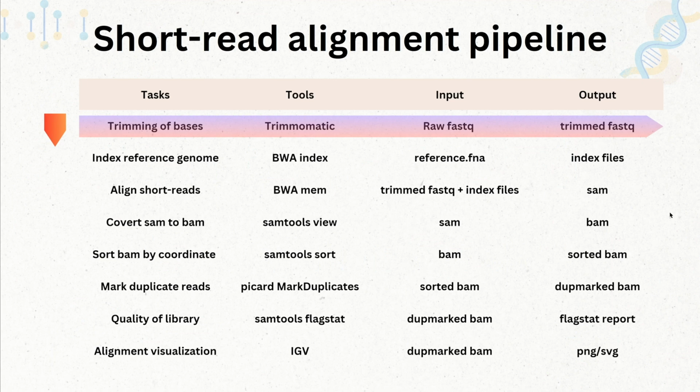Trimming of low quality bases and adapters are prerequisites for many downstream analyses of NGS data. I have made another video on how to use Trimmomatic to trim the low quality bases as well as adapter sequences. Please check this video to trim the reads using Trimmomatic.